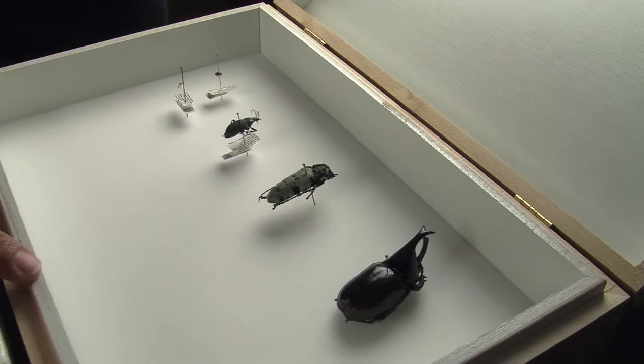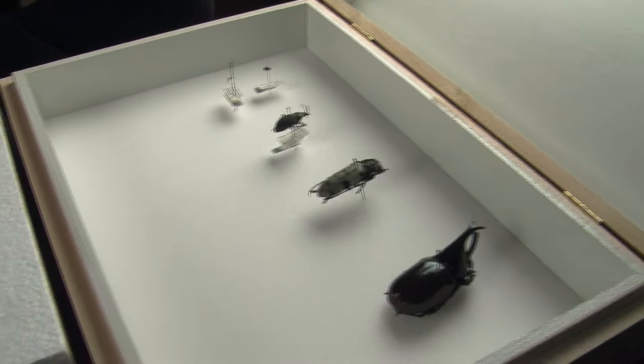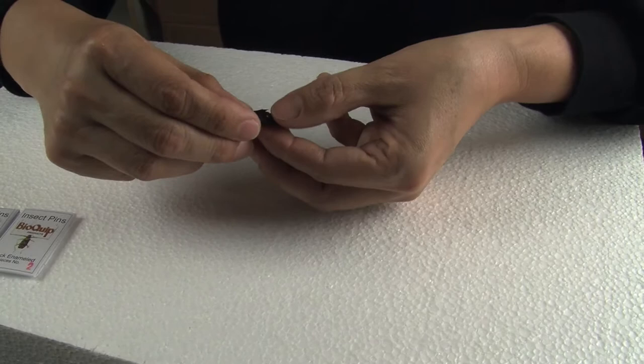Now that you have collected your insects, I would suggest you sort them out. You will have small insects, medium size, and large insects. If this is the first time that you are pinning insects, start with a medium or large size, like the one I'm going to use here to demonstrate the pinning procedure.